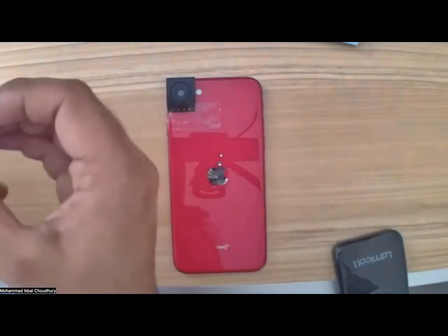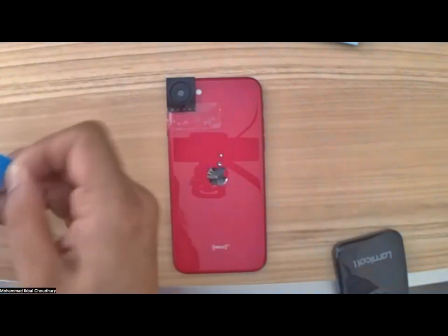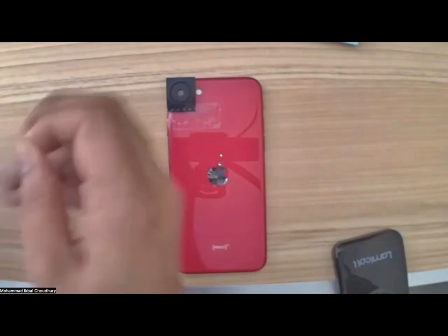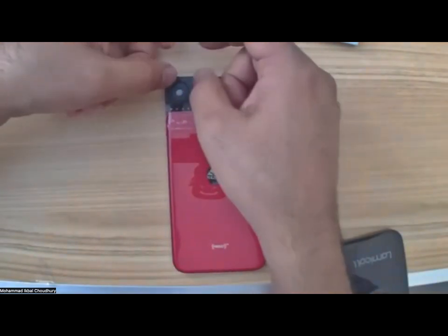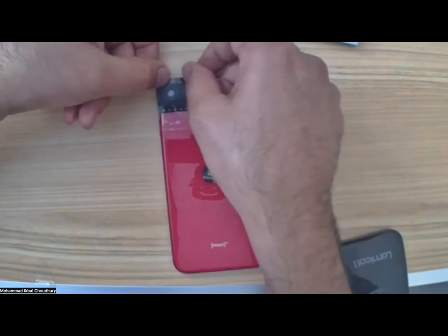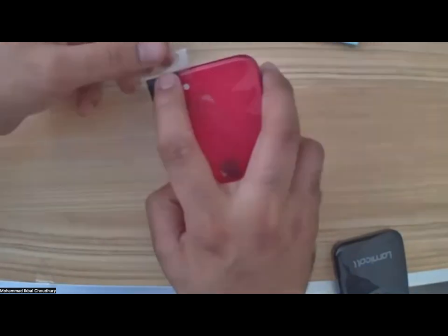My cell phone has a magnet just below the camera, so it tries to repel the magnetic adapter. So I have more issues connecting it, but overall you'll see it's going to be fine. I think it's centered well, and I will take another tape and try to tape the other side.